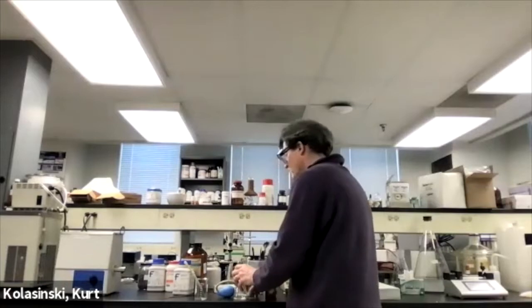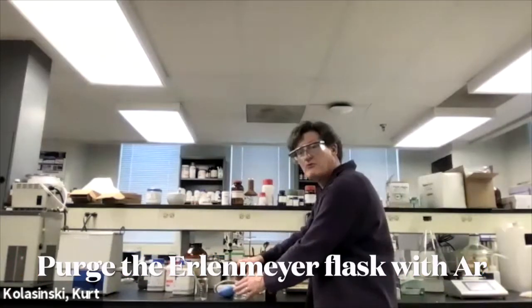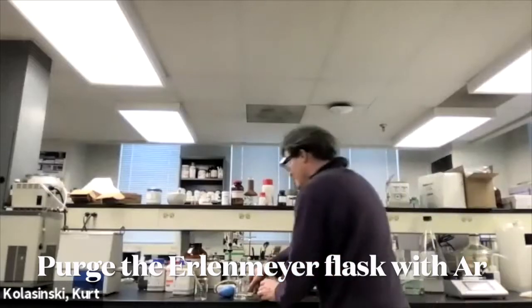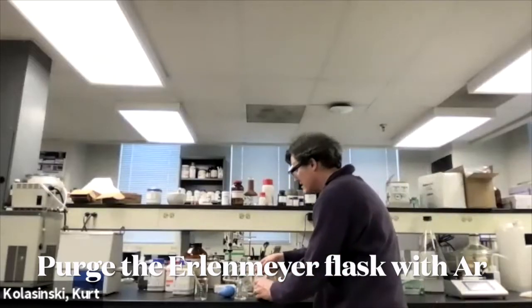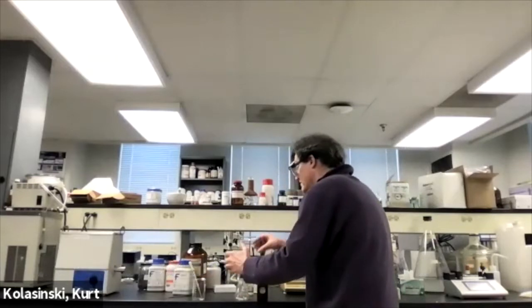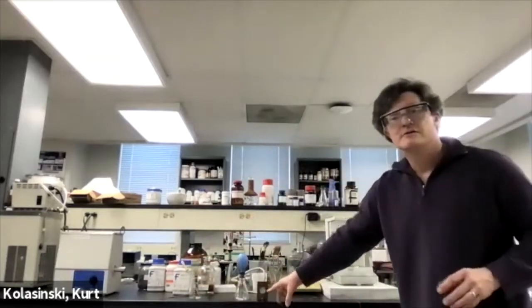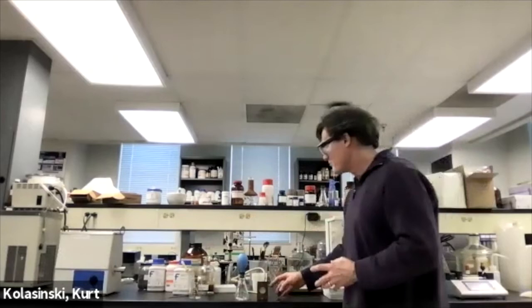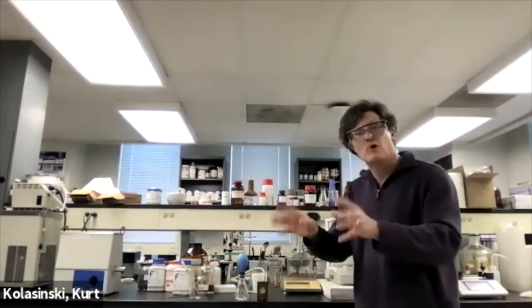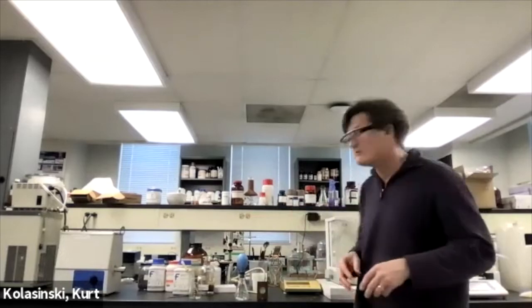Okay, so now we've purged this as well beforehand. Right? We purged it so we didn't have any water or H2O in there, just like we purged our cell. And now we let that build up a little bit. We purged this volume to get rid of water and CO2 in the gas phase, right? We purged it with argon because argon doesn't absorb infrared.